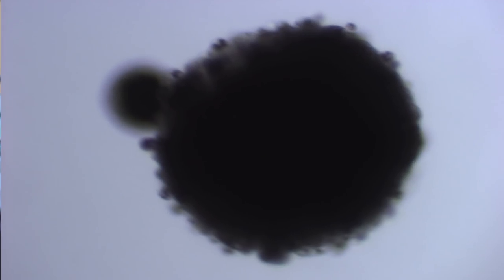That was really neat. In 2D, it's very hard to see these cells beat — essentially imagine a glass kind of beating; it wouldn't, it just vibrates. In 3D, we were actually able to get a very contractile response — it looks like a heart beating.